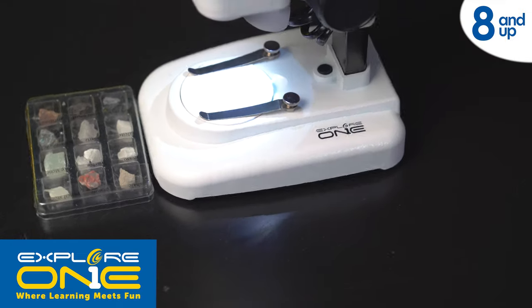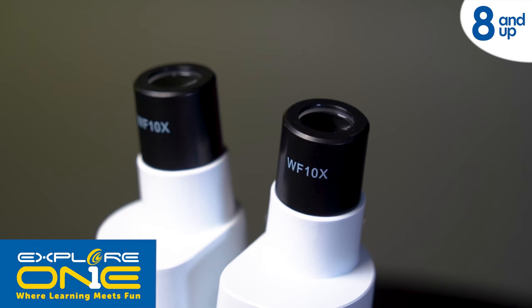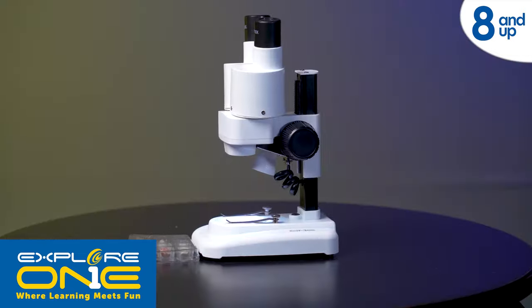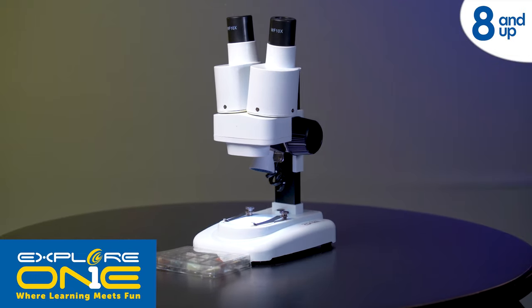Great at investigating larger objects, the scope has a wide field eyepiece, 2x stereo lens, LED illumination, and a geological specimen set to jumpstart investigations. Investigate your world with both eyes using the Xplore One 20x Stereo Microscope.